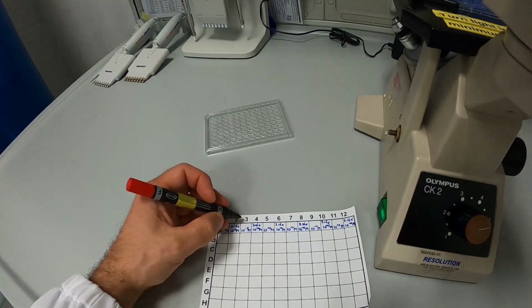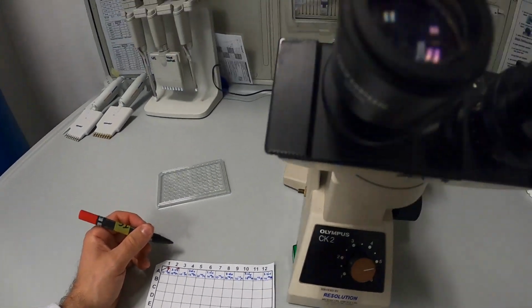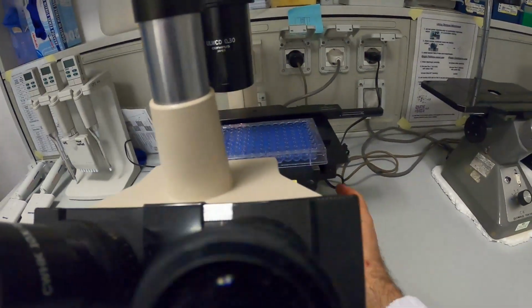Make your markings on paper. Record your observation. Go back to the wells.